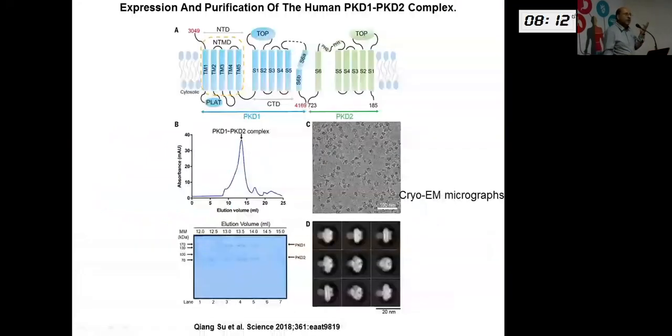You know, polycystic kidney disease is the 5th commonest primary renal disorder, and we know that it has to do with the polycystin channels of the non-motile ciliary processes that are there in the tubular cells, primarily. This is the histological representation of polycystin 1 gene arrangement and PKD2. And as you can see, using cryo-electron microscopy, one can actually see these channels. You can see these channels at higher magnification here.